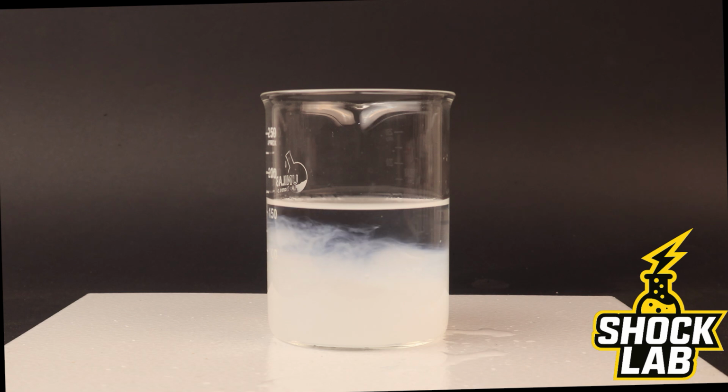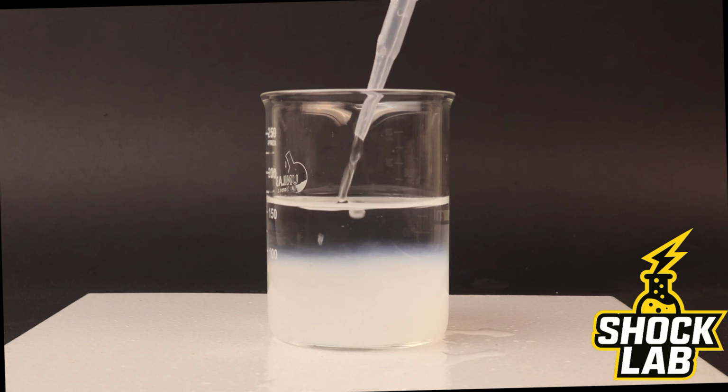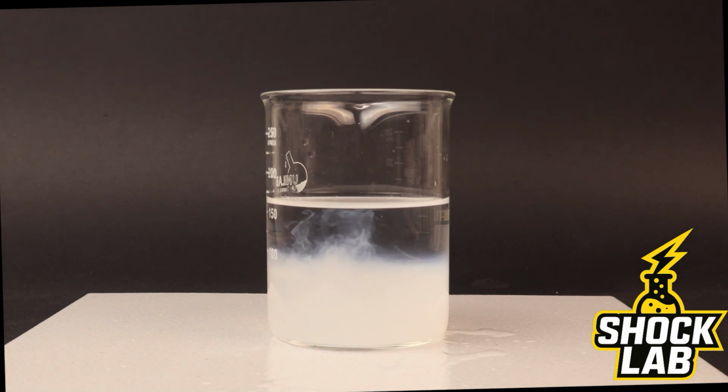Now let's add ammonia solution. Watch the white precipitate very carefully. As the ammonia mixes with the solution, something unexpected begins to happen. The white solid slowly starts to disappear. Little by little, the cloudy mixture clears until the solution becomes transparent once again.